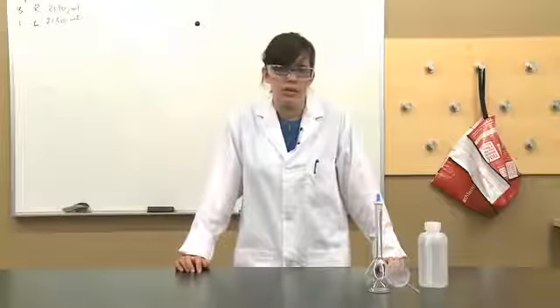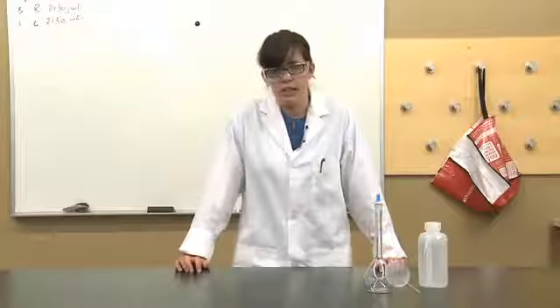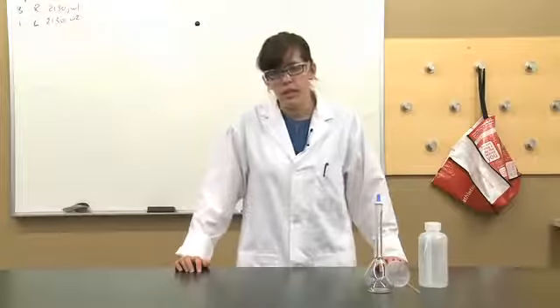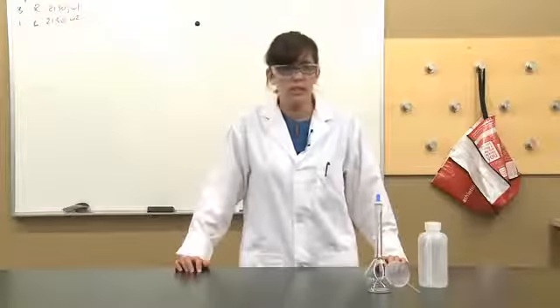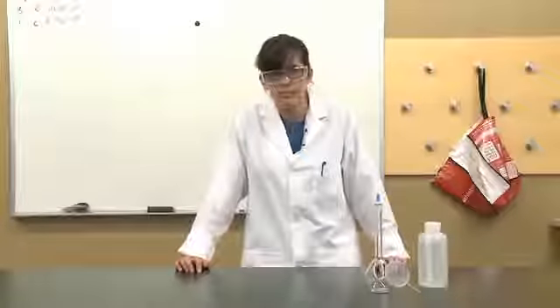A standard solution is a solution prepared that has a known concentration. This is very important in analytical chemistry as they are used in a variety of experiments. To be able to properly prepare a standard solution, you need to use a variety of different chemistry techniques that you've learned in previous videos.